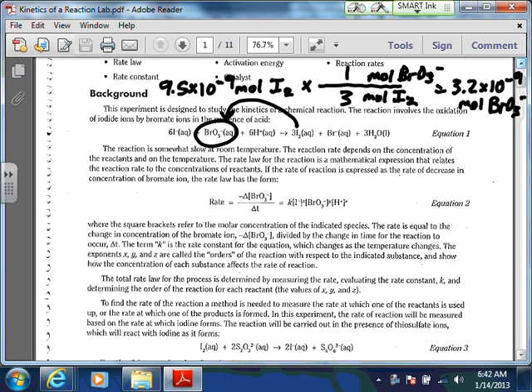Okay? Then, once we've got that, and whatever you calculate your concentration to be, because again, it's going to be different, then you're going to take that number. We'll figure out the concentration of it, and then we're going to figure out the rate. Now I would divide this number of moles by the volume, the total volume.